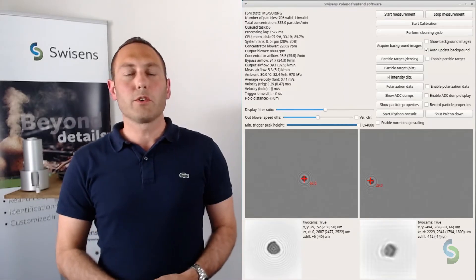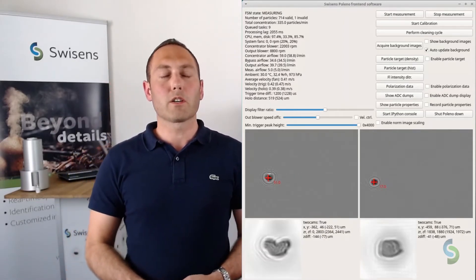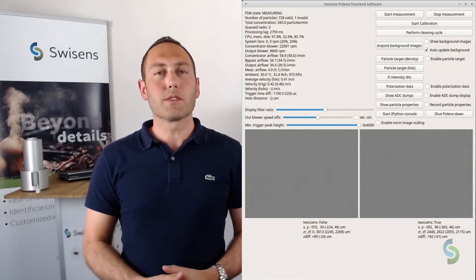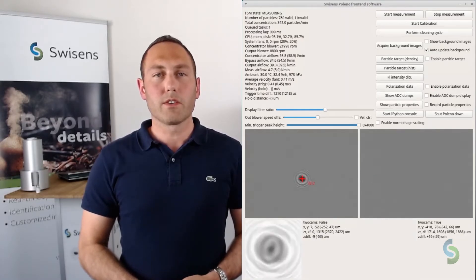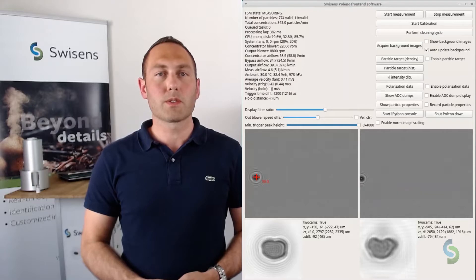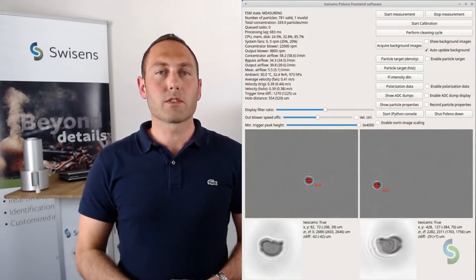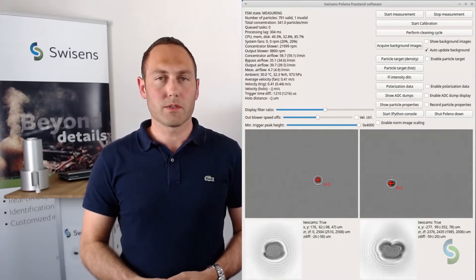The Swissence-Pollino UI gives you immediate feedback of the particles measured and the status of the machine. You can have a look at the reconstructed holographic pictures and check system parameters like, for example, the particle concentration. This interface is accessible directly on the device or also remotely. The measurement data of every single particle is stored on an internal database which can be replicated to an external server easily.